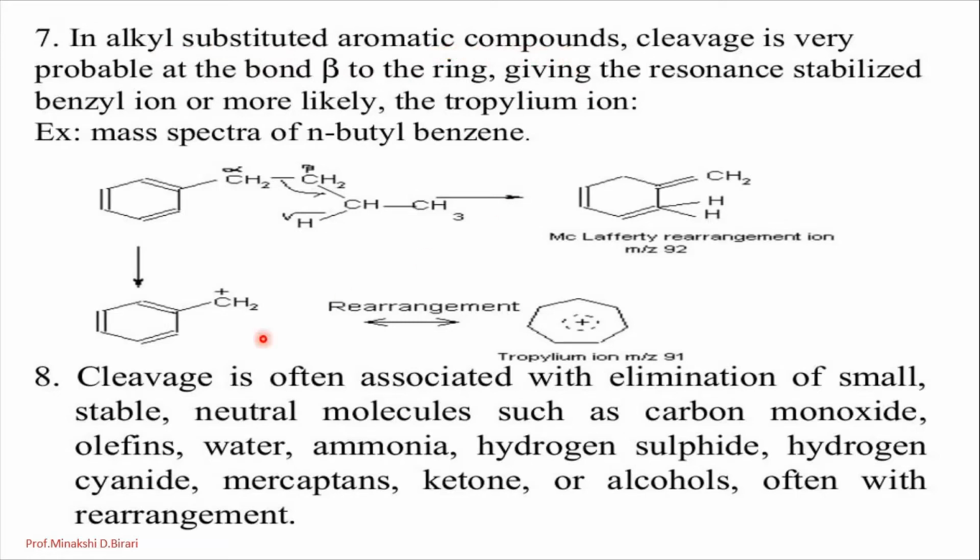Now the next one: the cleavage is often associated with elimination of small, stable, neutral molecules such as carbon monoxide, olefins, water, ammonia, hydrogen sulfide, hydrogen cyanide, mercaptans, ketone, or alcohols, often with rearrangement. So in different organic compounds, there is also cleavage associated with the elimination of stable neutral molecules.